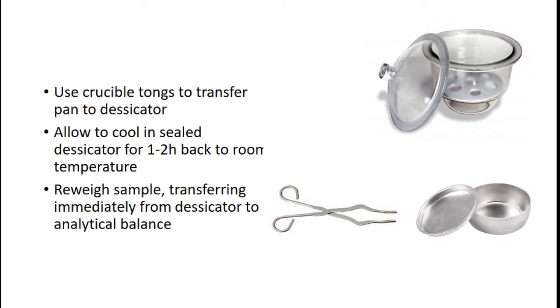Then we're going to transfer it to a desiccator for about an hour or two. Again, how long it requires is dependent on the quantity of samples that are being transferred over. I worked in a laboratory at one point in time where we did several hundred samples on any given day, and the mass of samples meant that we had to let it cool overnight because there was just so much thermal energy in the desiccators that it required that much more time to dissipate. But you want it to cool down back to room temperature, and for a small number of samples, 1 to 2 hours is plenty.